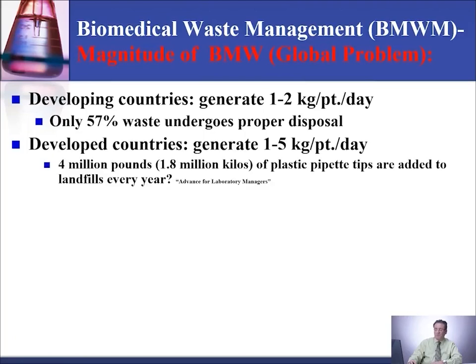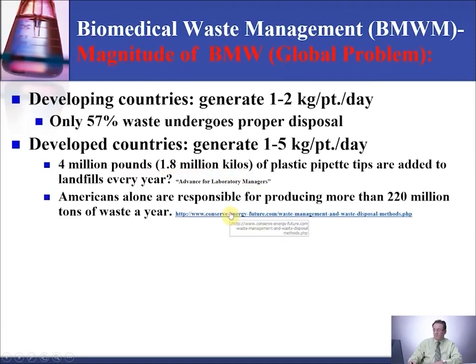Okay, and to give you some idea about these numbers when we talk about 1 kilo generated per patient per day: 4 million pounds, 1.8 million kilos, of plastic pipette tips are added to landfills every year.